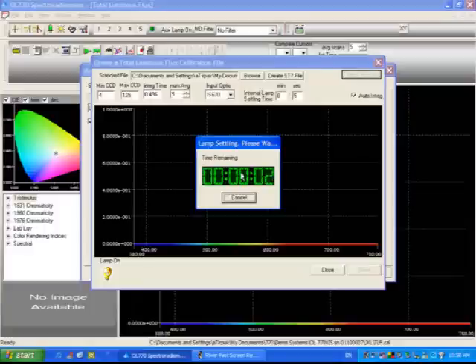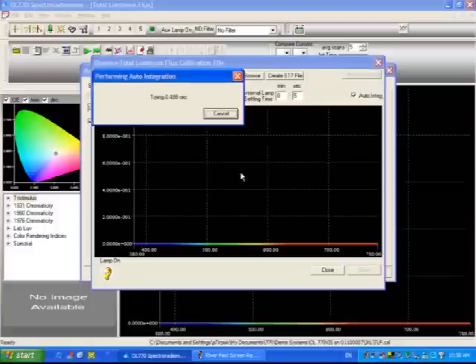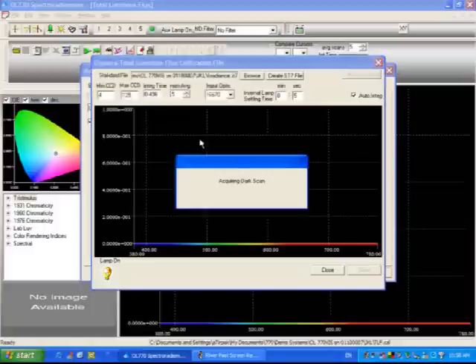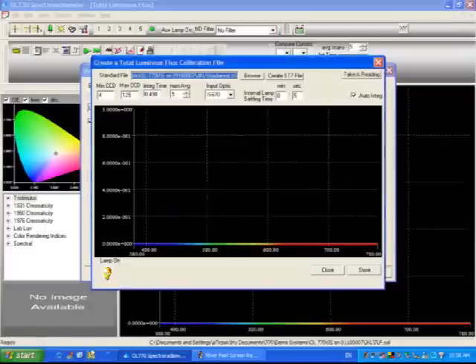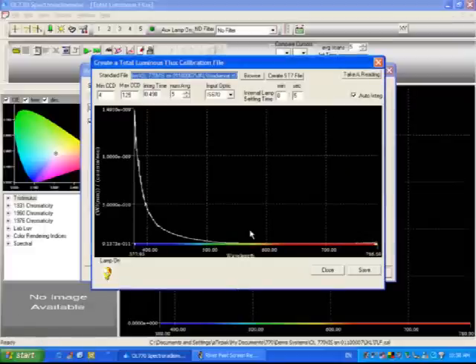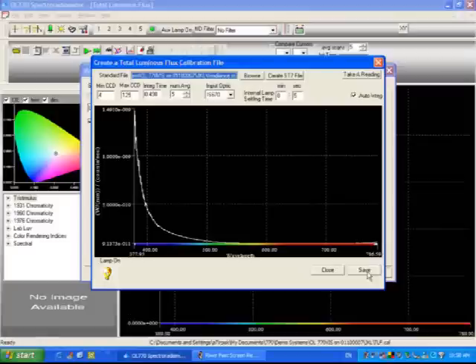The countdown timer will count down for five seconds, it'll take five dark scans as you can see here acquiring your dark scans, then it'll go ahead and take five measurement scans. This is a typical curve that you'll see with our visible system.